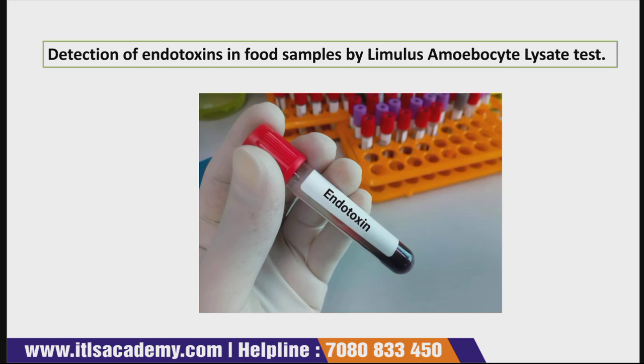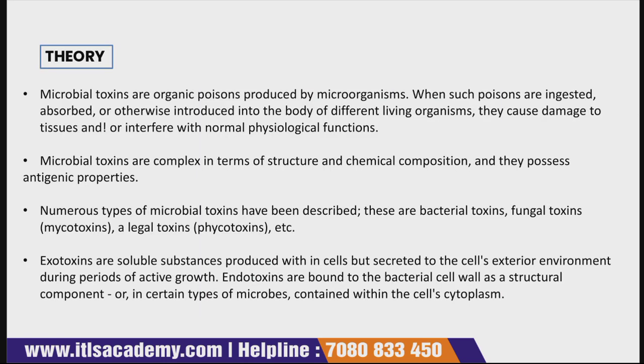Now let's move to the aim of the experiment, that is detection of endotoxin in food sample by the Limulus Amoebocyte Lysate test. So what is the theory of this?